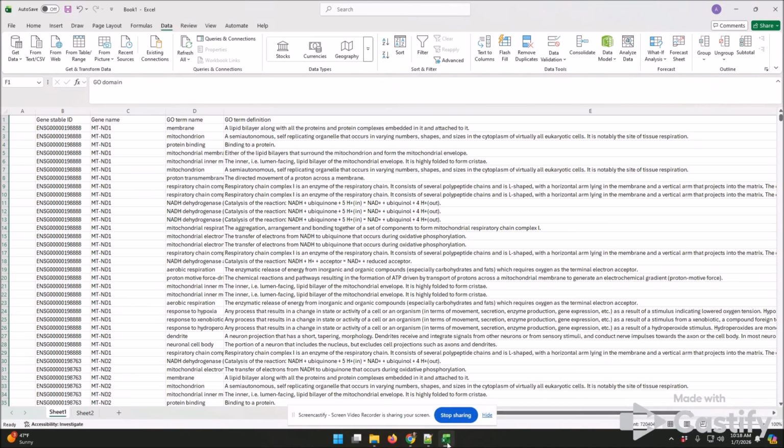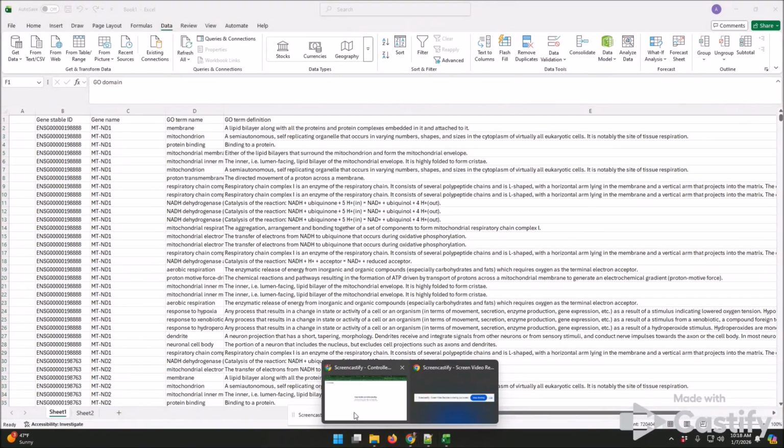Hopefully this whole exercise will help you to extract the gene ontologies of your genes. In that way it will be easier for you to know what function your genes of interest are performing. Fine.